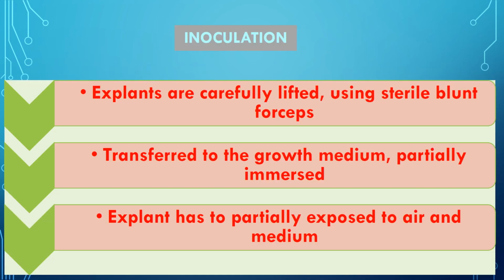Now let's see the method of inoculation of the explant into the media. The prepared explants are carefully and gently lifted using sterile blunt forceps and transferred onto the growth medium prepared earlier. The explants are pushed partially into the medium instead of just overlapping. Complete immersion of the explant is avoided. This ensures that the explant is in good contact with the medium and also with the air in the container for gas exchange during the growth period.